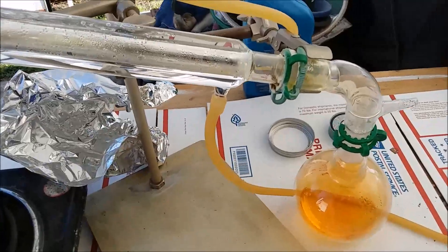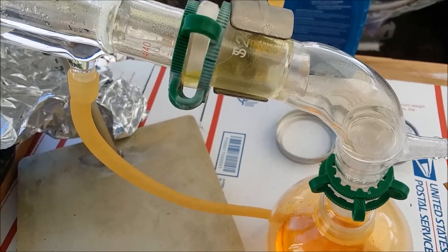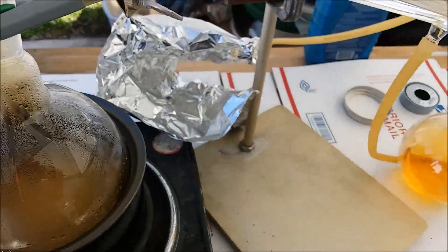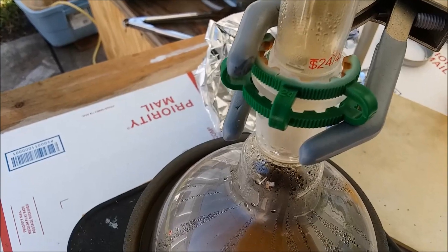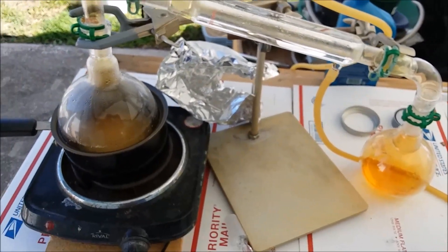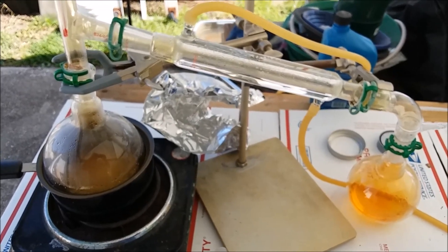I want to show you something here — hopefully it shows up on the camera. That joint is full to overflowing with liquid nitric acid. In fact it ran out on the keck clip and destroyed it — so there's another keck clip down. The fumes are getting to this one too, it looks like it's on its way out. This one up here is all bleached almost white but still holding together. Even if I ruin a few keck clips on each run, they're dirt cheap — it's still a lot cheaper than buying nitric acid. I bought a bunch off Amazon really cheap.